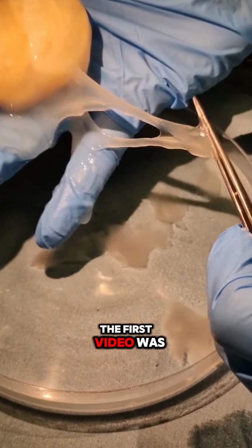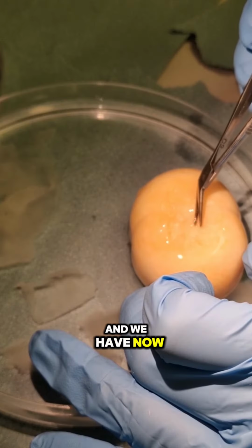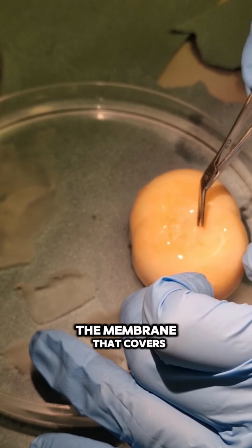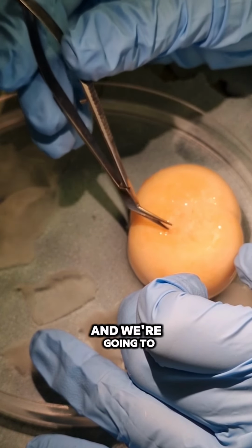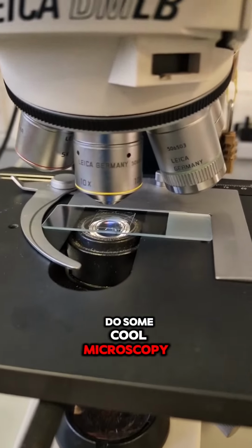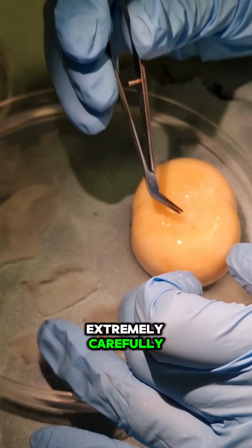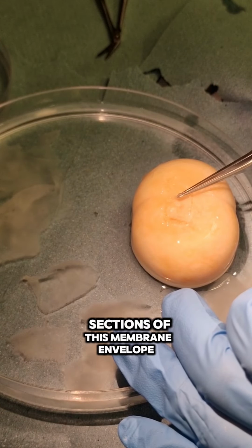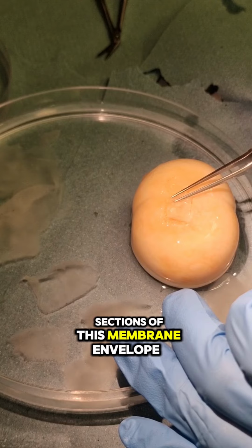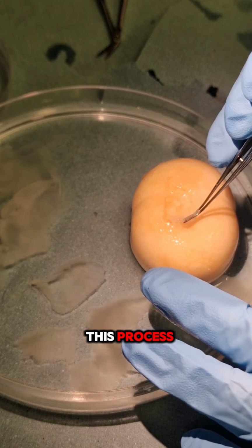The first video was a super satisfying egg white removal, and we have now reached the final layer, the membrane that covers the two yolks of this egg, and we're going to do some cool microscopy, so using microscopes to see if we can find baby tortoise cells. Extremely carefully, I am extracting different sections of this membrane enveloping the yolk, and we're going to do this process.